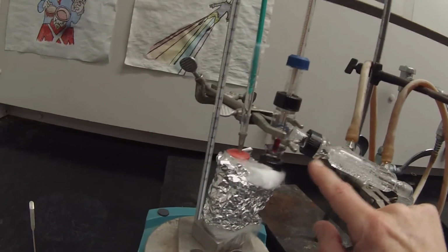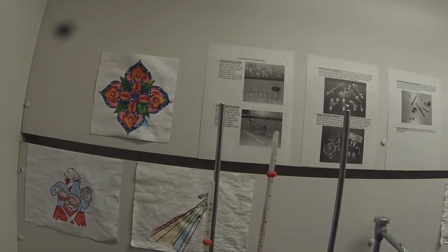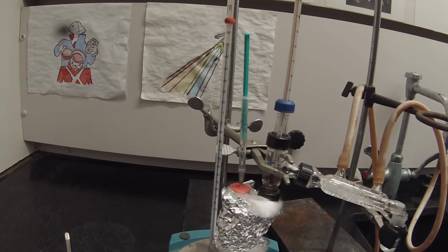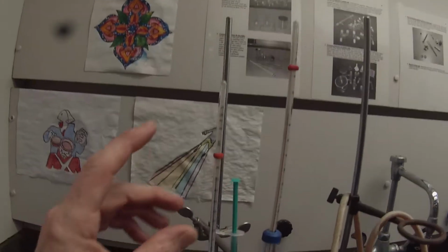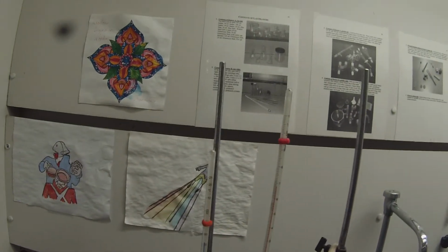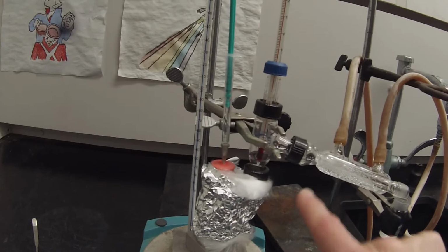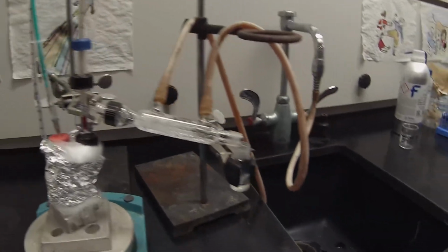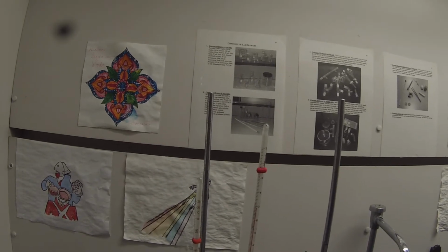See that there's a little bit of liquid in there now, so we're definitely starting to distill, but nothing dripped in. Another half mil in. Liquid in here, but obviously this has to fill before it can start going down and dripping into the vial. Dripping off the top there, getting close to 70.